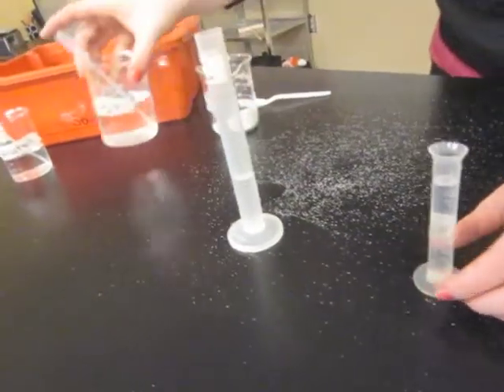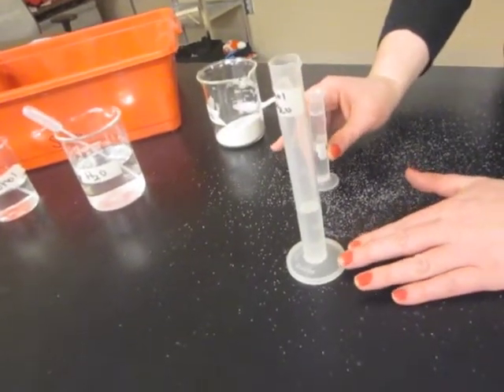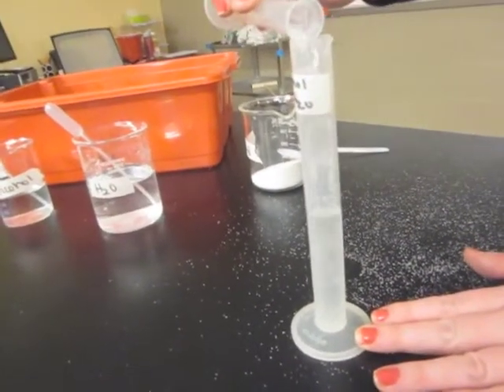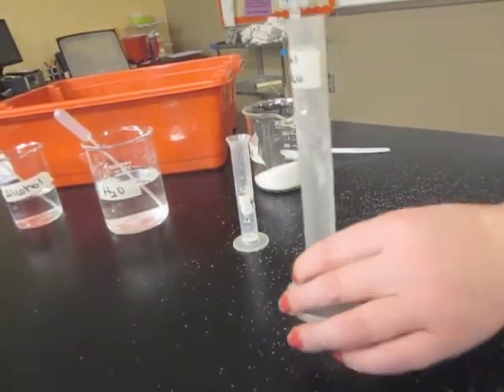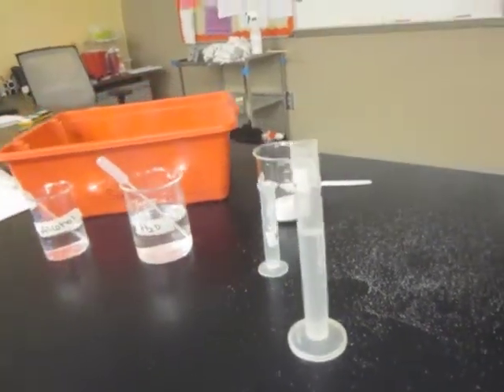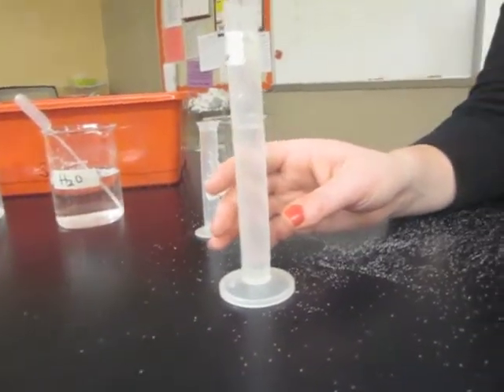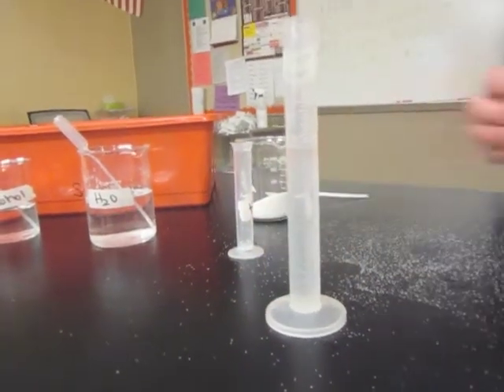Okay, now you're going to pour the water, you're going to pour all of it into the isopropyl alcohol. What do you think is going to happen? Alright, now as we pour it in, you can pour it all in. You can mix it around, and you know that you poured 10 milliliters of isopropyl alcohol in and 10 milliliters of water. However, and I know it's hard for you to see, but you'll see it in your group, why is it that the level is under the 20 milliliter mark right now and at the 19 level?